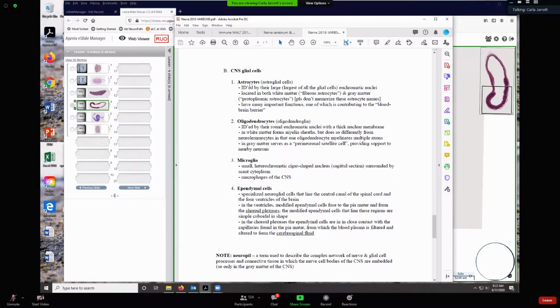And all of the cytoplasmic processes, and there are a lot of them in that gray matter, there are dendrites, there are axons, and there are lots and lots of nerve cell bodies and the cell bodies and cytoplasmic processes of all these glial cells. And they all just kind of mesh together. And the resolving power of the light microscope is not high enough to visually distinguish the boundaries between all these different cytoplasmic processes and cell bodies.